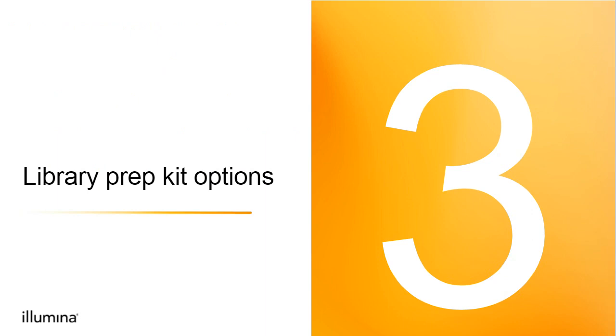Okay. So let's move into the largest section of the webinar today, and that's talking about our different sequencing options and the specifics of using FFPE with those.